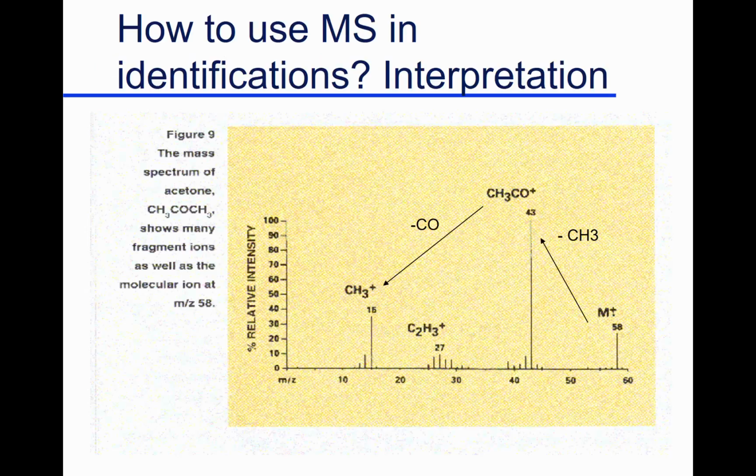So we'll get to data interpretation. As I alluded to a couple of times, if somebody does this for a living, maybe not 24 hours a day, let's say only 12 or 15 hours a day, you get pretty accustomed to seeing these fragmentation patterns, and you start understanding what comes from what. And you can actually start putting molecules together simply by knowledge.